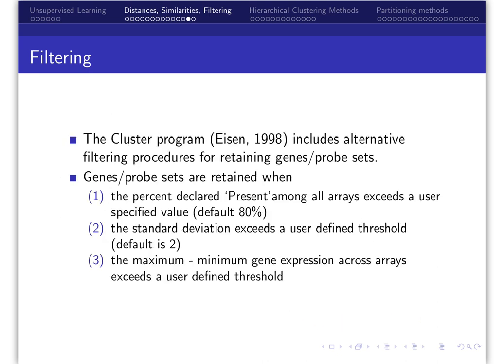The authors of the seminal paper that applied clustering to microarray gene expression data developed a publicly available software program called Cluster, and a corresponding TreeView program. For some time, these were widely used, being among only a few available software tools for easily clustering microarray data. That software included the following filters.